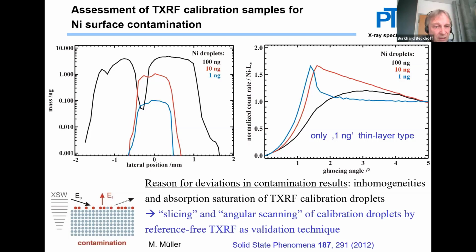And you see here the cross-section, the lateral position across those droplets, as against the mass, the absolute mass in nanograms that we had at the various positions.